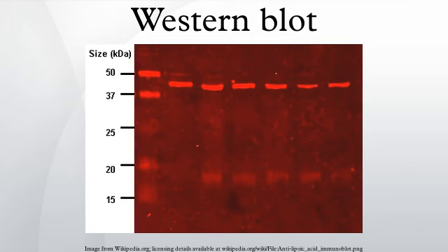Other related techniques include dot blot analysis, Zestern analysis, immunohistochemistry, where antibodies are used to detect proteins in tissues and cells by immunostaining, and enzyme-linked immunosorbent assay. The method originated in the laboratory of Harry Towbin at the Friedrich Miescher Institute. The name Western blot was given to the technique by W. Neil Burnette and is a play on the name Southern blot, a technique for DNA detection developed earlier by Edwin Southern. Detection of RNA is termed Northern blot and was developed by George Stark at Stanford.